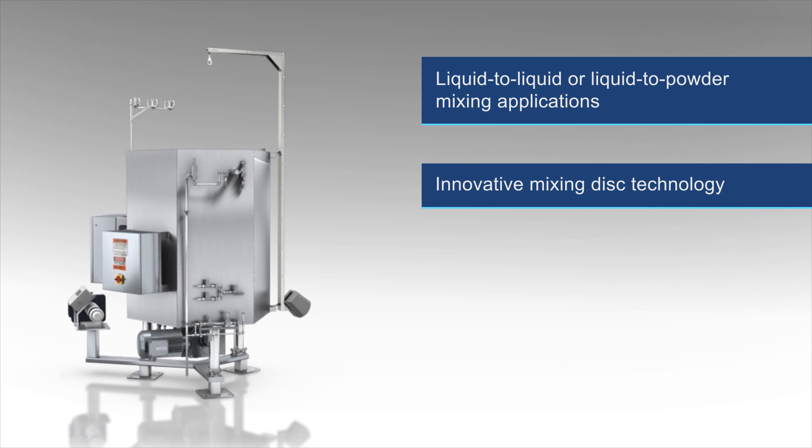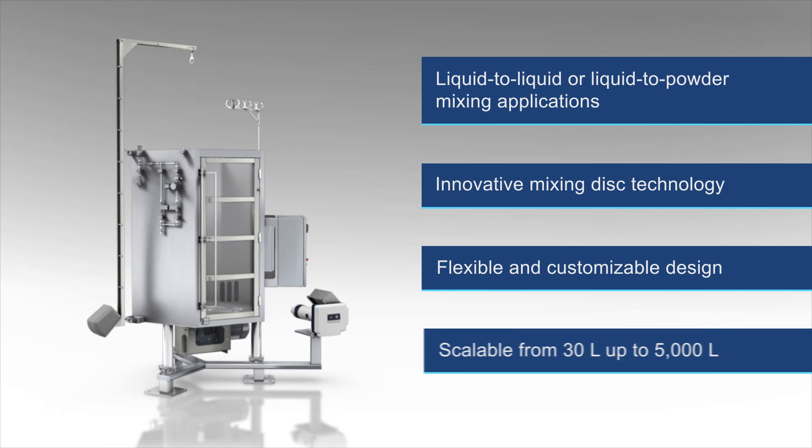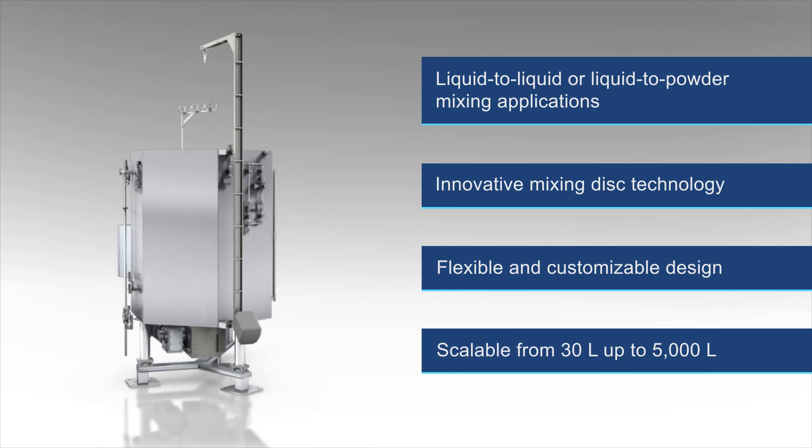It features innovative mixing disk technology, a flexible and customizable design, and is scalable from 30 liters up to 5,000 liters.